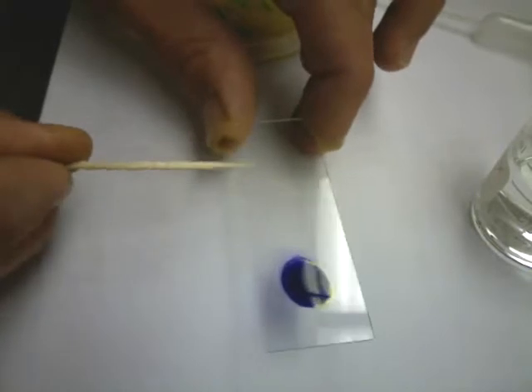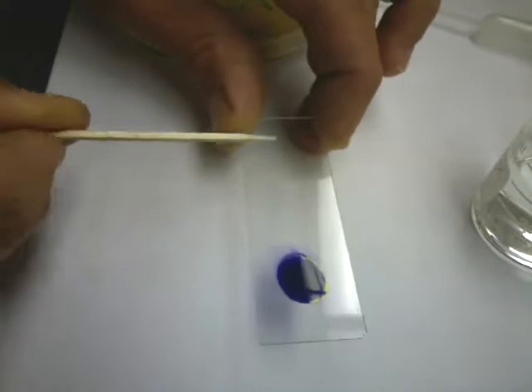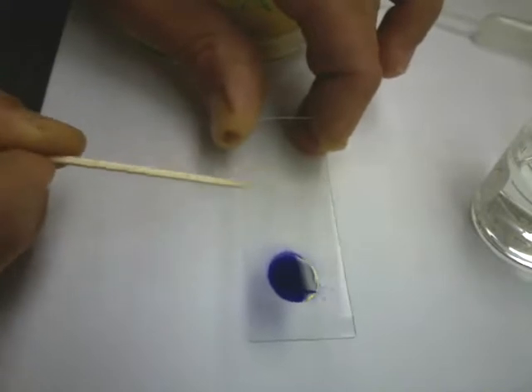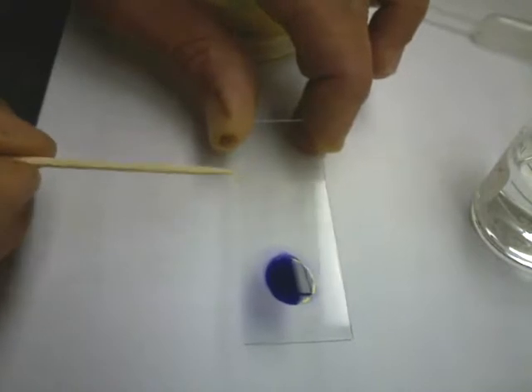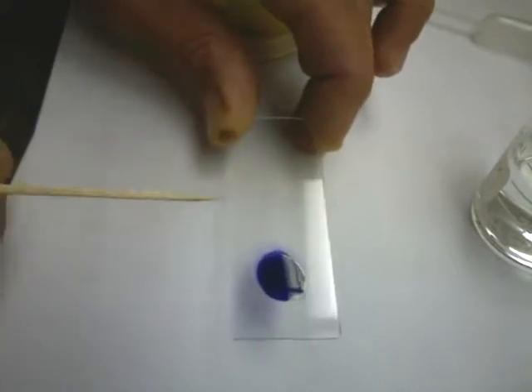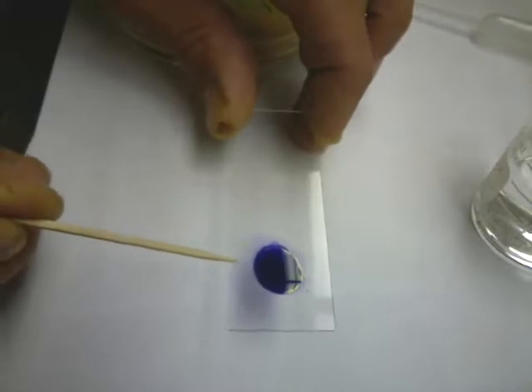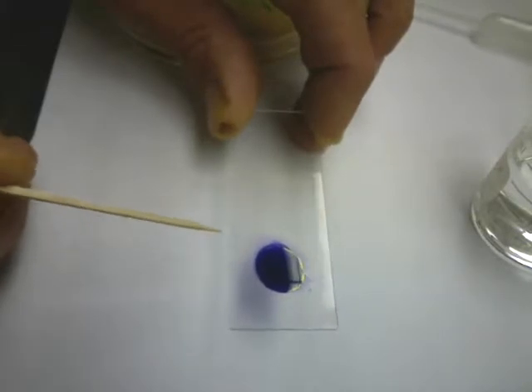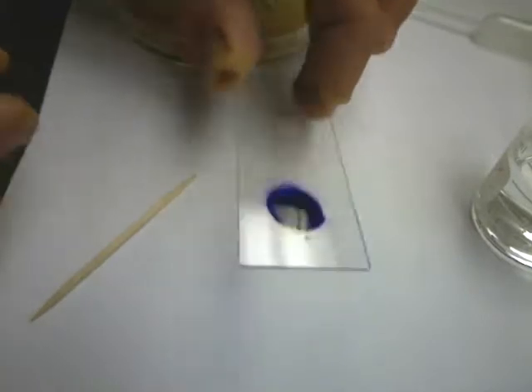After it dries, I will heat-fix it to the slide for you. That means it will be passed through a flame. That's a little tricky, so I'll be heat-fixing all the slides for you. Once they're heat-fixed, we're going to put a drop of crystal violet — this is a very aggressive stain. You do not want it on your clothes or anywhere else, because it will not come off. That's why it's called a stain.